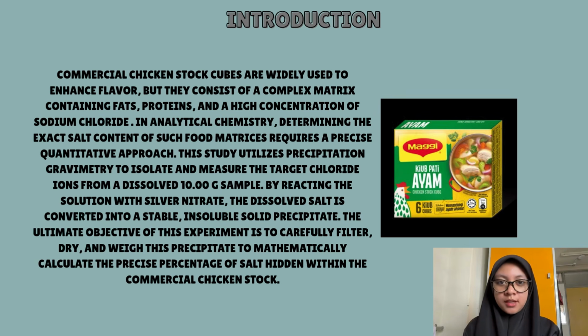We all know this humble chicken cube. It is a staple in our kitchen, packed with intense, savory flavor. But from a chemist's perspective, this cube is a complex matrix of proteins, fat, and a very specific target analyte, which is sodium chloride, common salt.